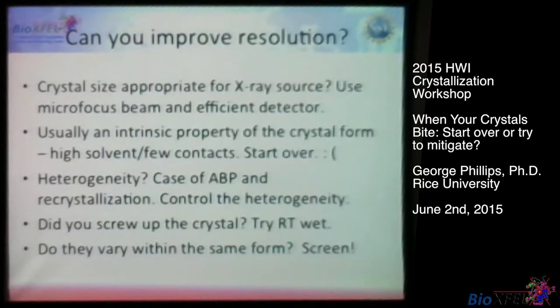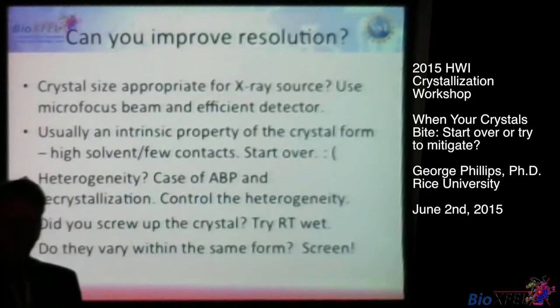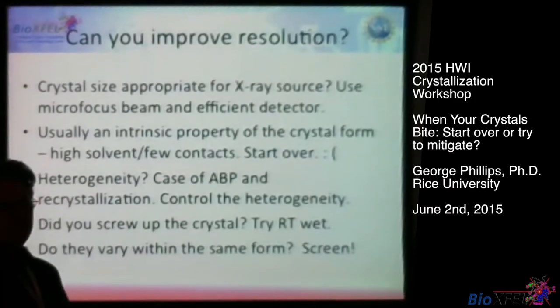And I think the old view used to be you picked one crystal and you went with it without really surveying others. We've got some value from doing myoglobin in five different crystal forms. There, sometimes you can learn about variability. Sometimes the crystals have different properties. They may allow different substrates to bind. They may be in different conformations. So one lesson I have is just because you optimize one crystal form and it works, if it's not too hard, go ahead and line up a second one or a third one, and you might learn something quite interesting.